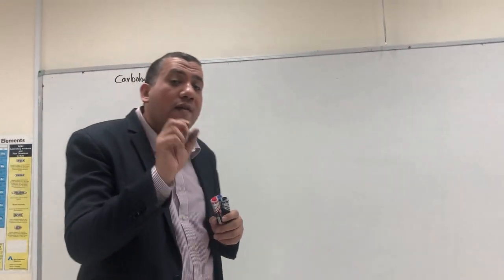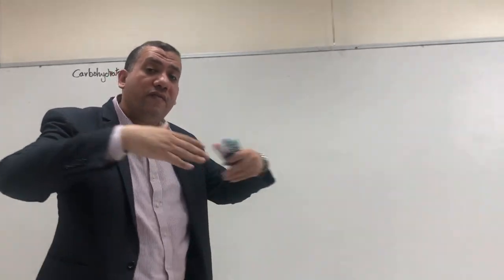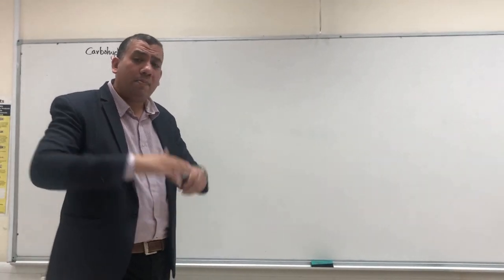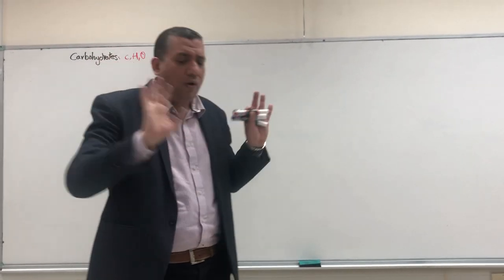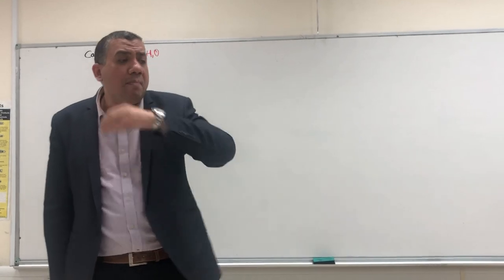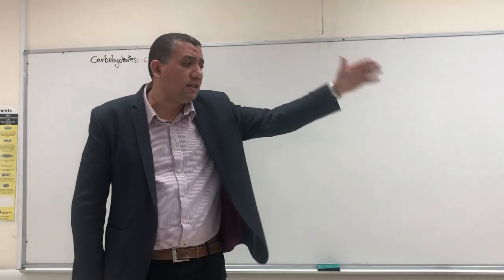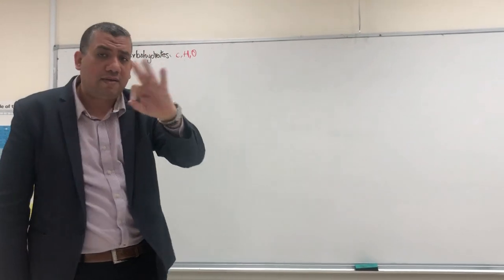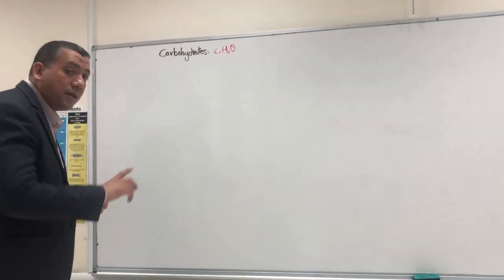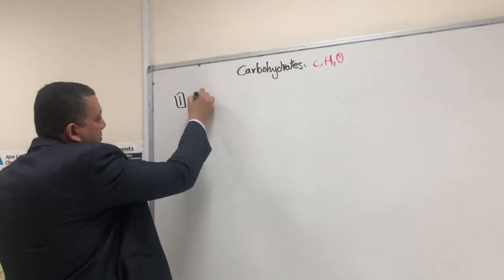We have here a very small scheme, a very good, generalized scheme. We have many tests for the scheme of the carbohydrate, but here I will explain only three tests. But again, I need to tell you that we have many tests for the carbohydrate scheme, it could reach up to 7 or 8 tests, but I will explain only three tests, how to differentiate between them. Number one, I will start with the Molisch test.